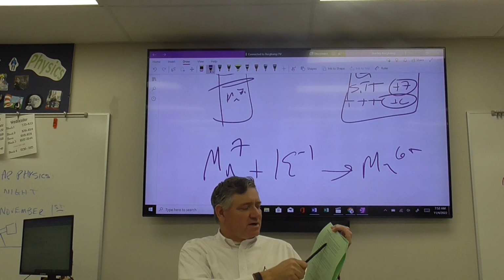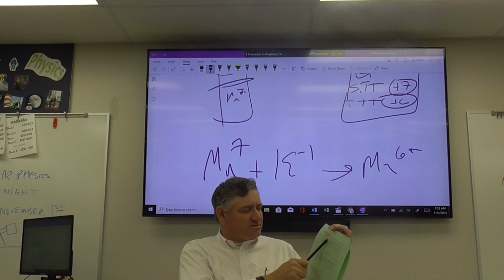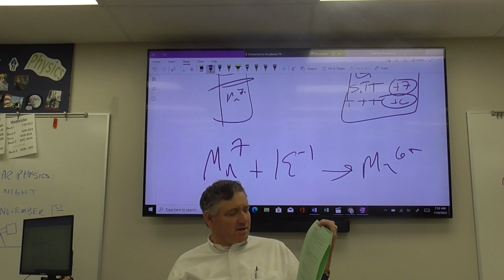Then you can put those in a 100 milliliter beaker. Then you're going to add 1.5 to 2 milliliters of the 0.1 molar potassium permanganate and stir until all the potassium hydroxide dissolves. If the pellets don't dissolve after stirring, add 1 milliliter, then stir.